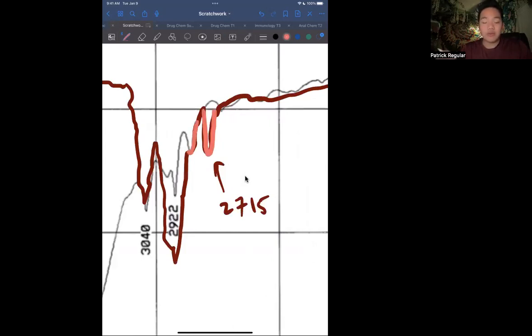And the second one, the leftmost, not 9 times out of 10. Half the time, it's going to be eaten up partially by a peak like that right there. Part of it's going to be eaten up. It's all subject to ambiguity because, again, IR spec is not perfect. All right. Consider your options.